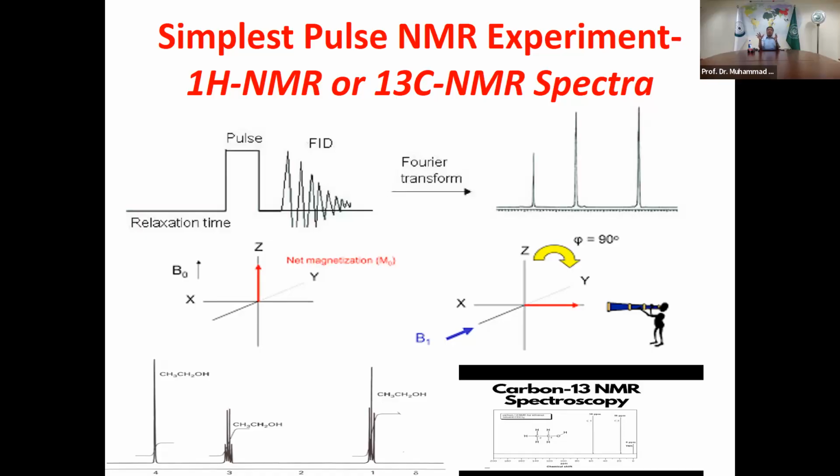And now, there are literally experiments in which you have not one, but thousands of pulses. You just play with that. And if you understand what happens when you give a pulse, where it will go, and then there is also a concept which we will discuss with you. It's called rotating frame of reference, where these vectors are on the XY plane, then you would be able to understand this multi-pulse NMR experiment, which we will discuss later.